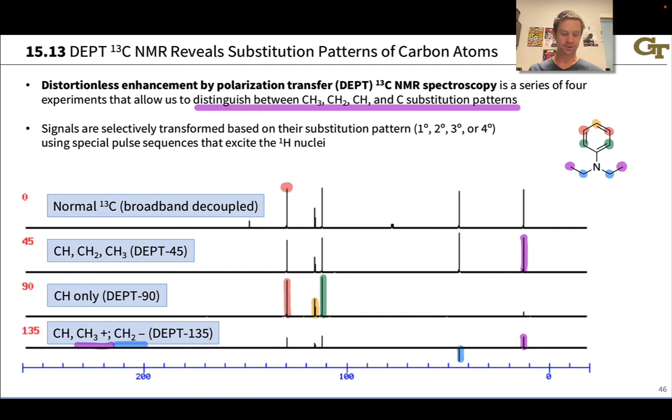At this point, we've accounted for all the signals in the original carbon-13 NMR spectrum. We've got a CH in the aromatic region here, a CH here, and a CH here. We've got a blue alkyl signal here, CH2, and this purple signal corresponds to a CH3. DEPT is pretty powerful. It helps us associate signals in a carbon-13 NMR spectrum with particular carbons in the molecular structure.